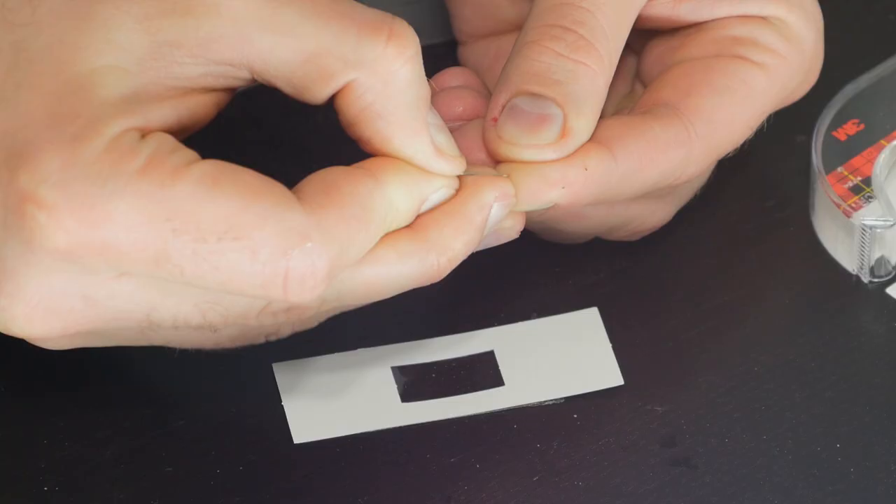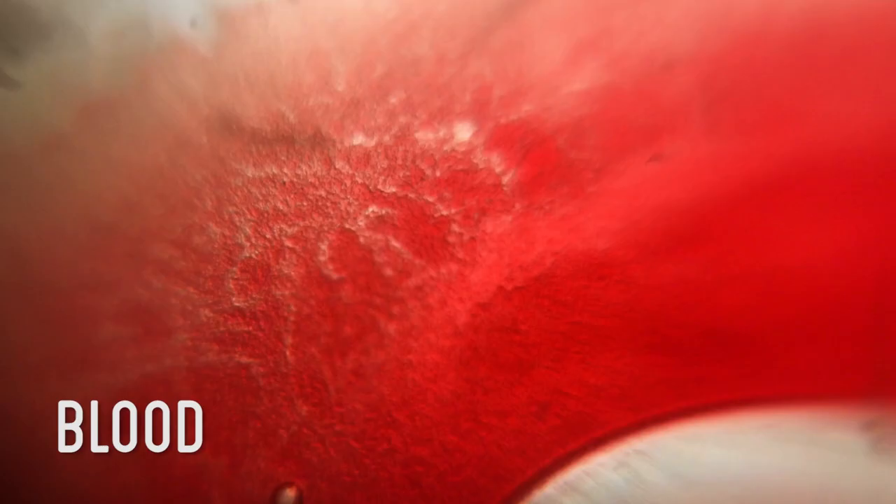Janet suggested checking my own blood, so I pricked myself and checked it out. Focusing the lens, you end up bumping and squeezing the slide, so it's hard to tell if there's any actual movement in the blood cells themselves. But it does appear you can see the actual individual cells.